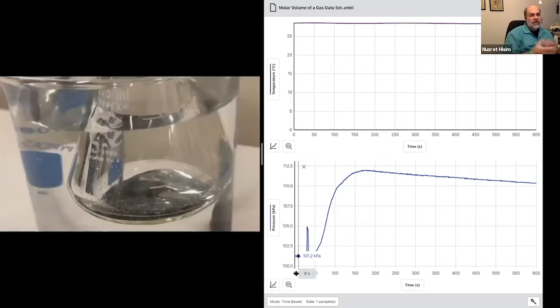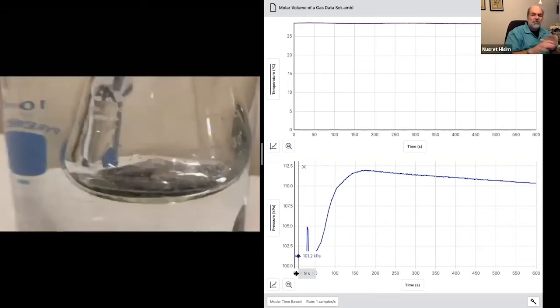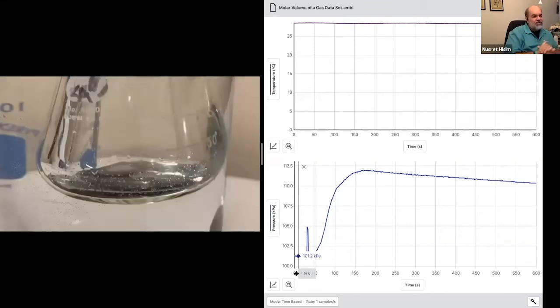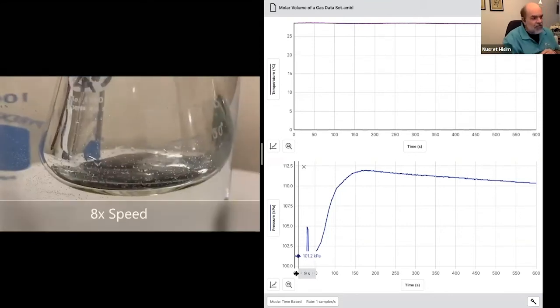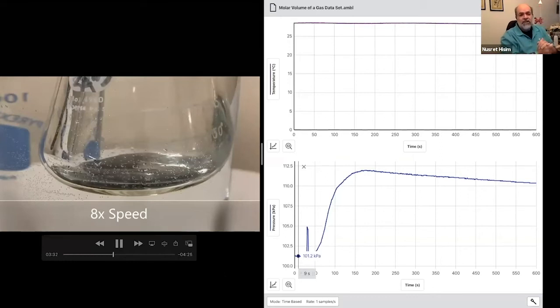Now the data is starting. If you have your Graphical Analysis file open, we are right here where I tapped on it and we're a few seconds in. What Melissa just did is inject the HCl into the flask, then to account for the extra volume of the 5 mL of HCl, she pulled the syringe back. The pressure dropped again, but we had that initial pressure, so we know what the initial pressure of the air was in there. Now the change in pressure is going to be due to the hydrogen being added.